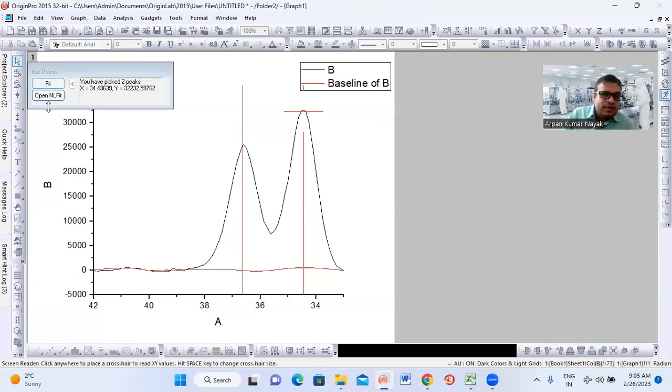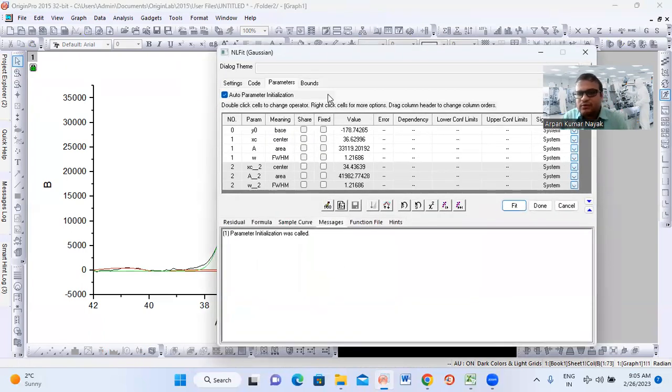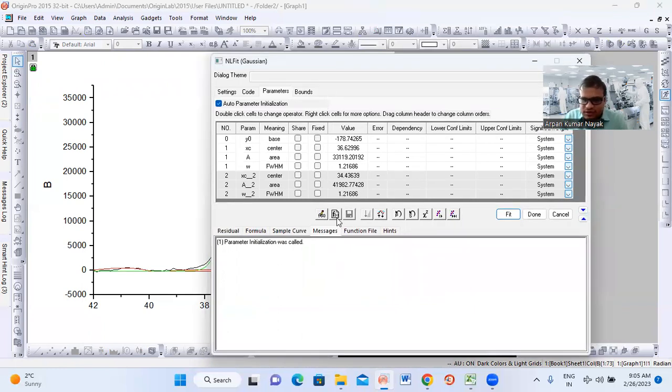What we will do, we will open here. This one I will click, so that we make some iterations and get a proper fitting. So now here you can see one more window will come. In that window, you can click all these things and understand what the points are, how they fitted, all these things they mention. Here you can see fit until converge. So you may click several times for the proper fitting. So we can do one iteration.